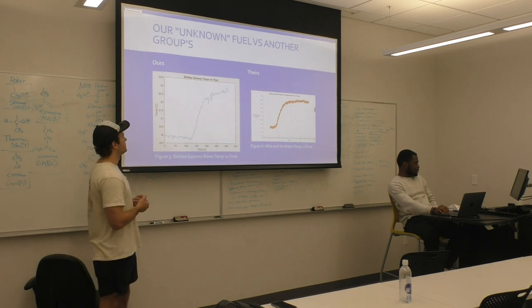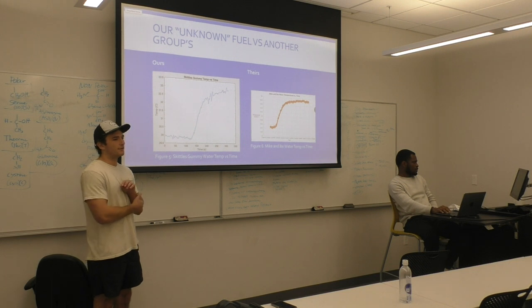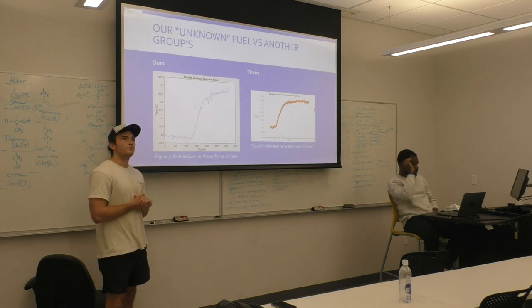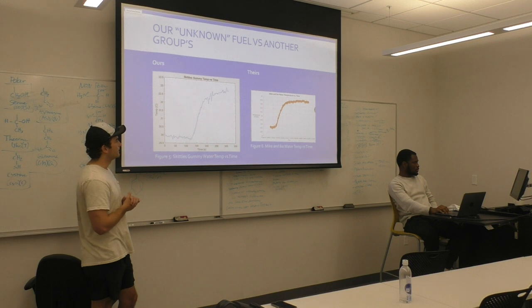If we were to do the experiment again, we should have waited longer for some of the heat to dissipate out of the calorimeter. That was probably an error we made. With the Mike and Ike, they calculated their Q to be about 26, and ours was only about 11, but our Skittles gummy was significantly bigger than the Mike and Ike.